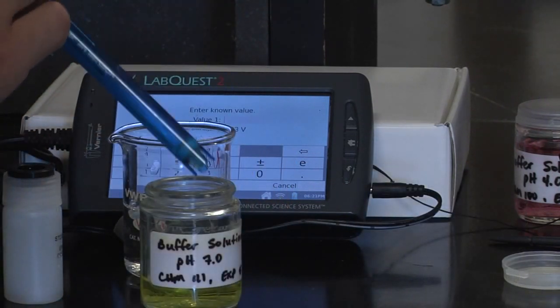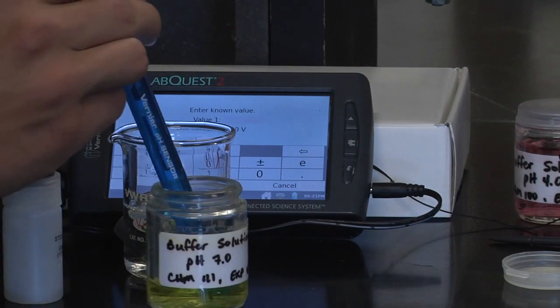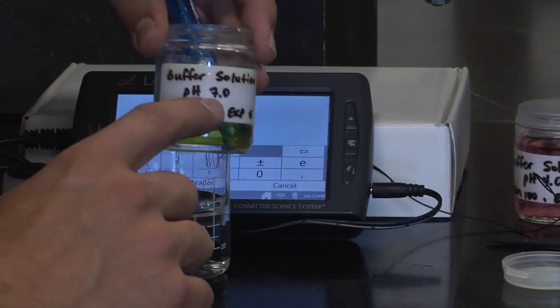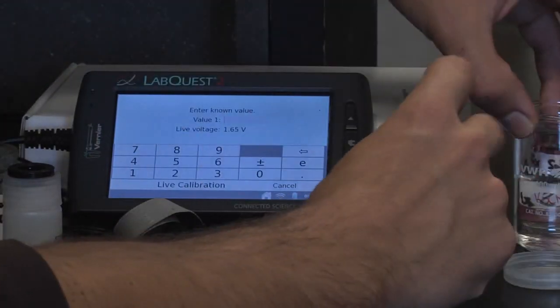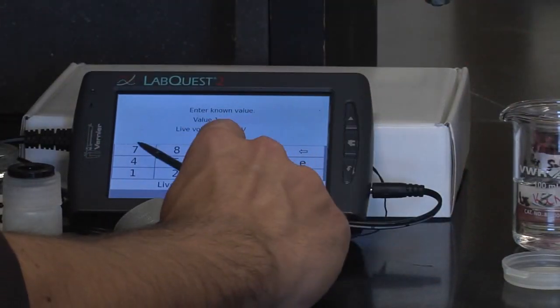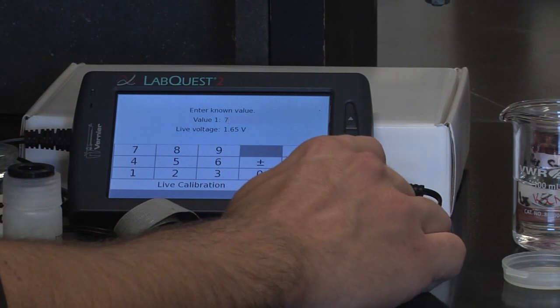Once it's dry, we can go ahead and insert it into our buffer solution. Notice that here we have a buffer solution of seven. So we will type in the number seven on the LabQuest and press keep.